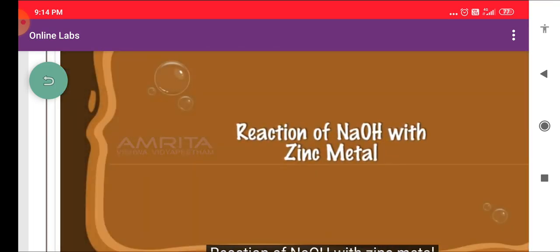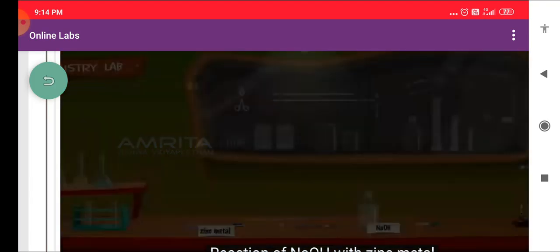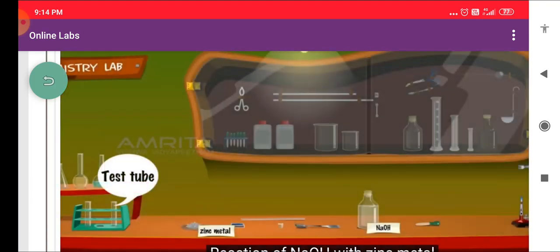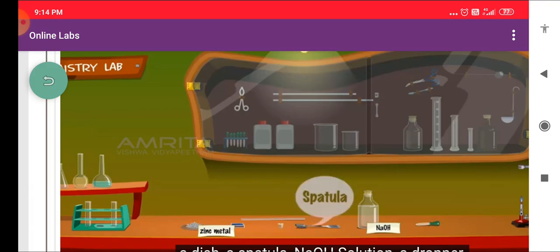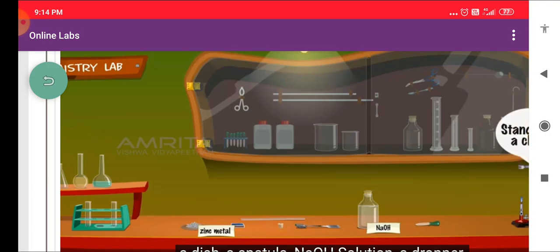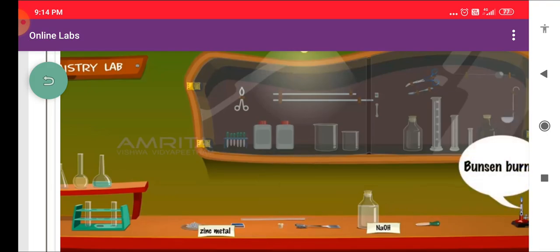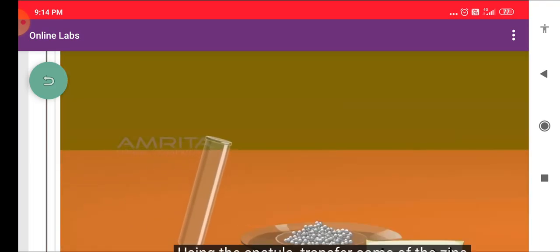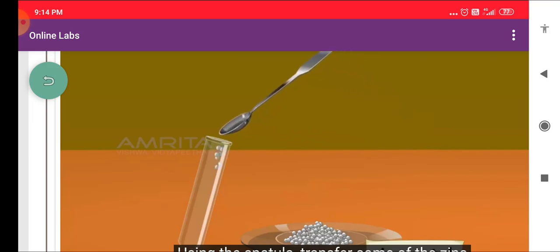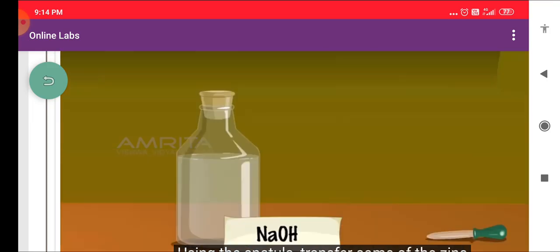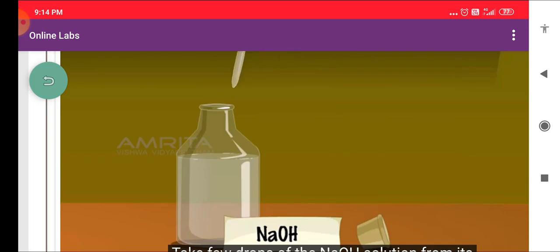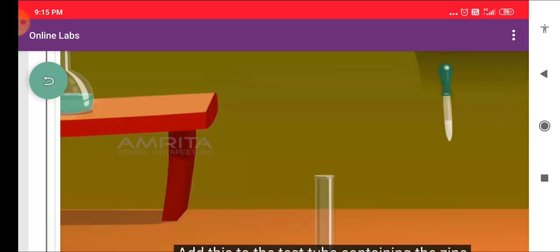Reaction of NaOH with Zinc Metal. We require a test tube, some Zinc Metal in a dish, a spatula, NaOH solution, a dropper, a stand with a clamp, a single board cork, a jet tube, a Bunsen burner, and a match box. Using a spatula, transfer some of the Zinc Metal from the dish into the test tube. Take a few drops of the NaOH solution from its bottle using the dropper and add this to the test tube containing the Zinc Metal.